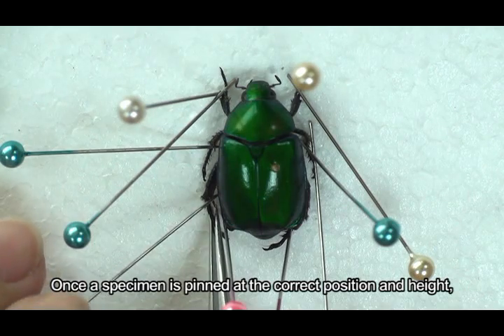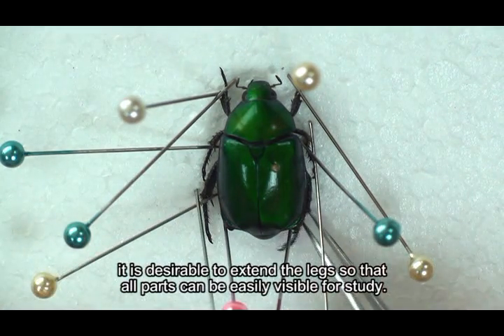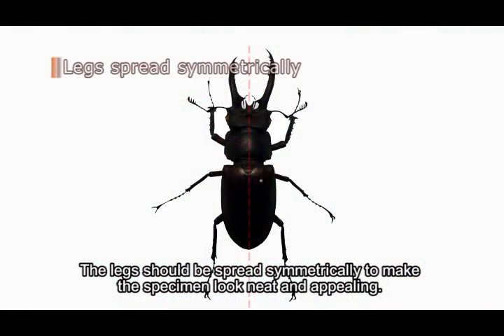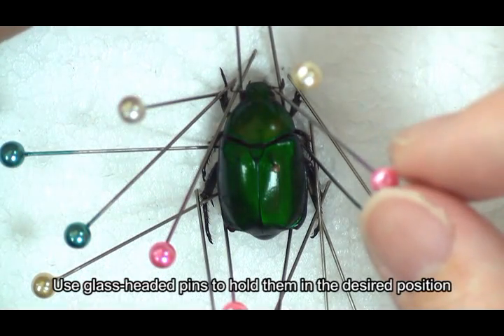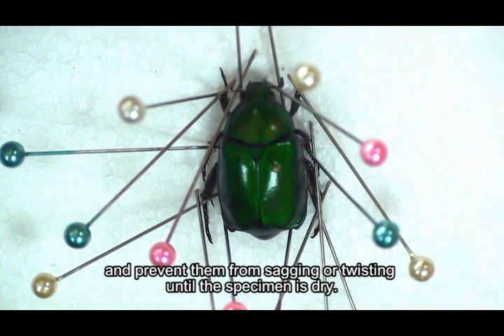Once a specimen is pinned at the correct position and height, it's desirable to extend the legs so that all parts can be easily visible for study. The legs should be spread symmetrically to make the specimen look neat and appealing. Antennae and abdomens deserve extra attention — use glass-headed pins to hold them in the desired position and prevent them from sagging or twisting until the specimen is dry.